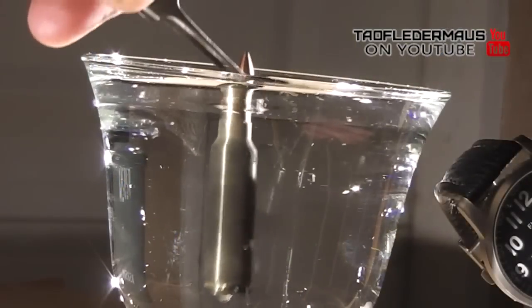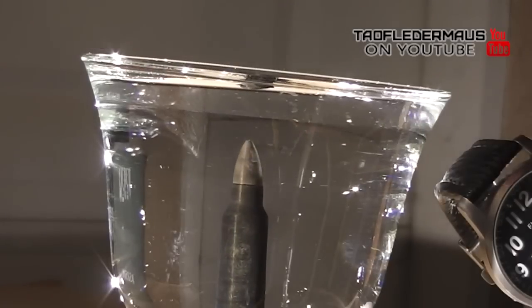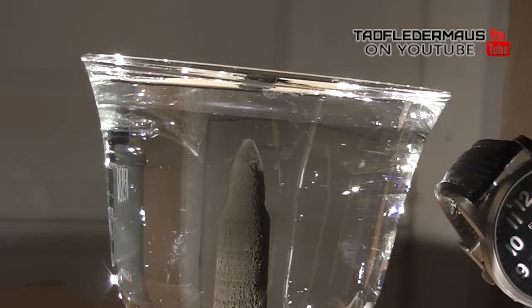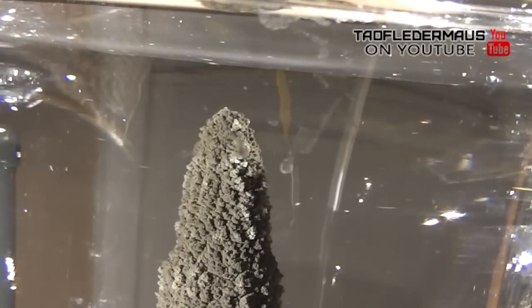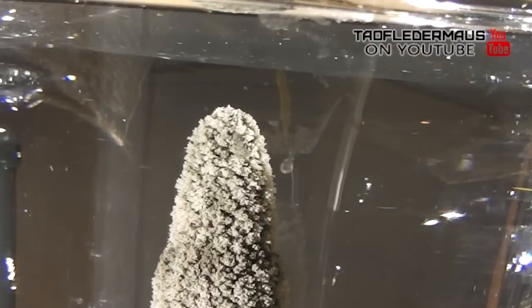You can see the reaction starts immediately as soon as we immerse this cartridge in the solution. This entire sequence is about 30 minutes in duration. We'll zoom in so we can get a little better detail of the unusual hair-like growth of the silver crystals.